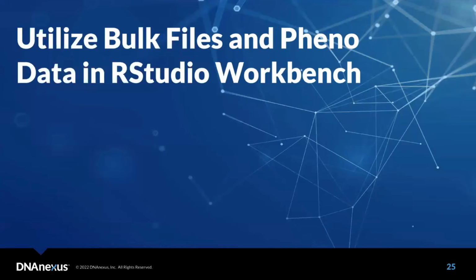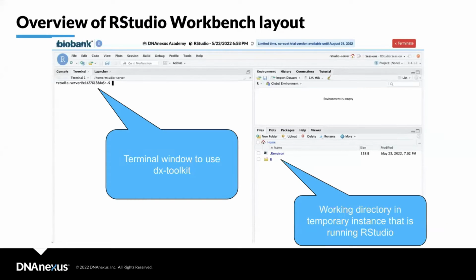So we launch our RStudio and we want to actually do some work there. So we'll show you some examples of how you can work with phenotypic data and how you can access bulk files. As I was already showing in the overview, we have a terminal window here where we can use dx-toolkit. And here we see what is inside the working directory of the temporary instance that is running RStudio.